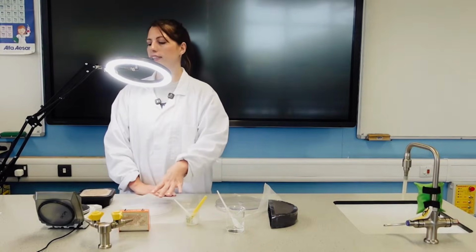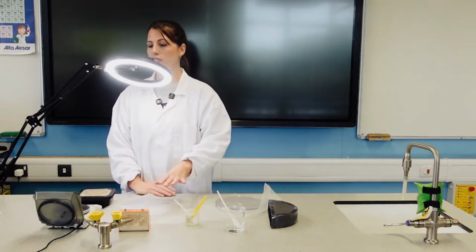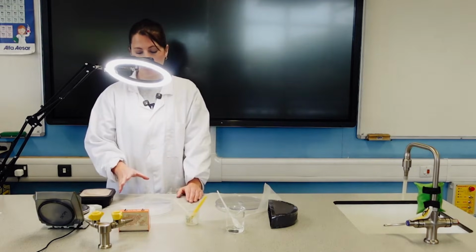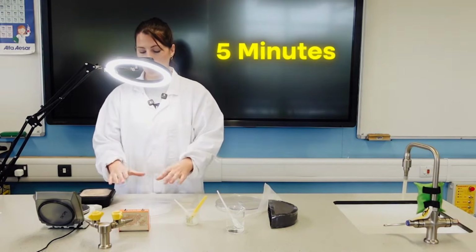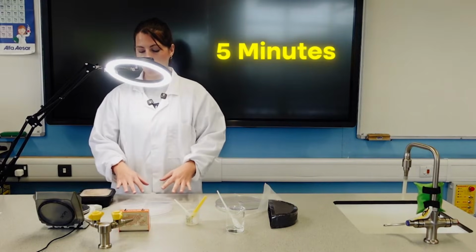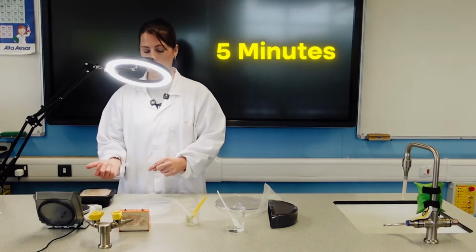I'm going to leave the maggots there for 5 minutes. So they've got 5 minutes to make their decisions. And then depending on whether the students are investigating taxis or kinesis, you may just want to leave it set up 5 minutes. When the 5 minutes is up, get the students to take a photo. So they've got that snapshot of which chamber the maggots are in, and they can count how many there are in each chamber. That's what I'm going to be doing, so I can then calculate a chi-squared statistic afterwards.